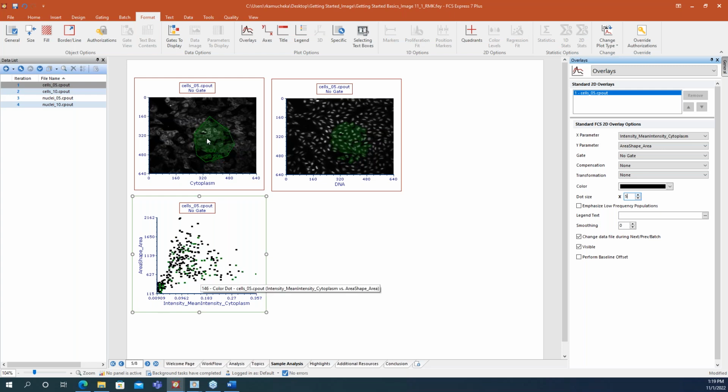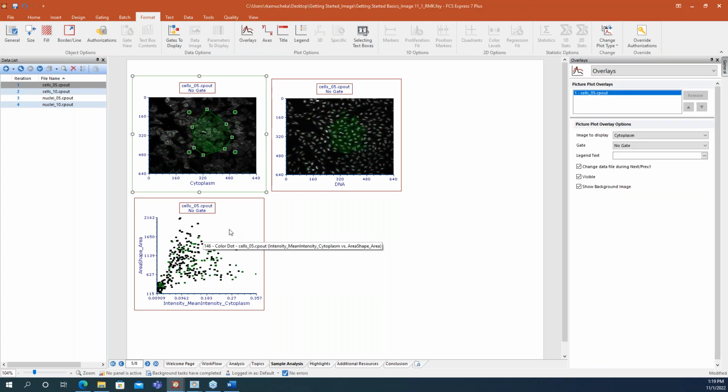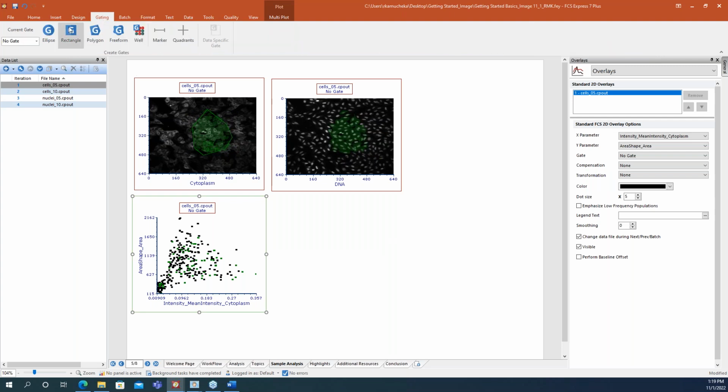increase that event size, we're also already interacting with our other plot. We already see that this gate is here. If I wanted to apply that gate, I could drag this gate onto this plot, or I could go to my gating tab and just select it if I only wanted to look at populations that were falling in that gate. So we have that flexibility, that interactiveness, to make sure that while you're doing your analysis, you're getting exactly what you'd like to get from FCS Express.